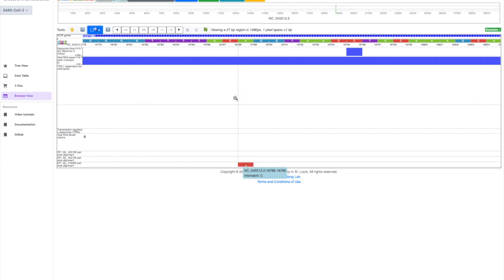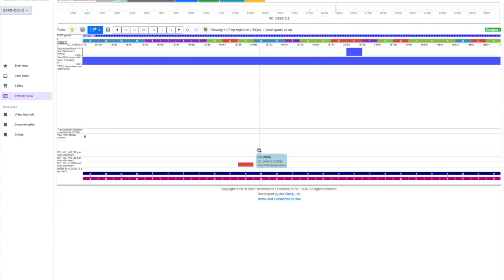Several additional tracks are available to be loaded into view and can be accessed under the Tracks tab. When selecting Annotation Tracks, you can see that the Genomic Ruler and NCBI Gene Locations tracks have already been loaded in. The user can additionally load into view a GC percentages track and/or genome comparison tracks, which compare either MERS or SARS to the SARS-CoV-2 reference. Once loaded in, the comparison track reveals all differences between the two species, which can be best visualized by zooming into a location of interest.